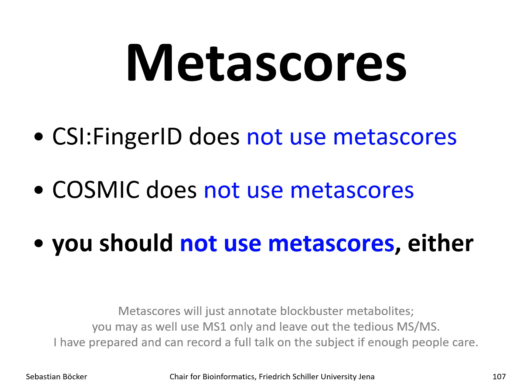I showed you this example of the bile acid conjugates, and they researched in a structure database, and all the structures were novel. There is no production volume for a hypothetical structure. And if there's a production volume, it doesn't mean that it's present in the biological sample. Yeah. So in short, the argument is that these metascores tend to annotate only the blockbuster metabolites, so you see the same stuff over and over again.